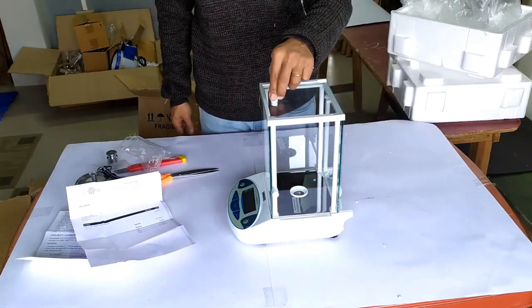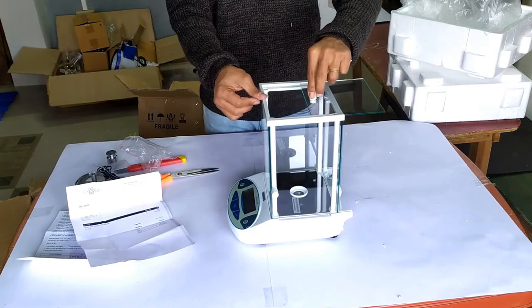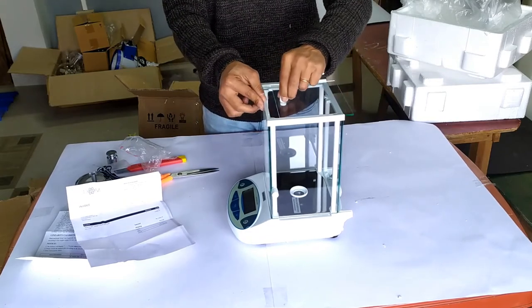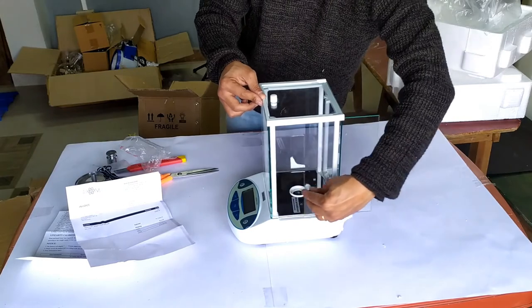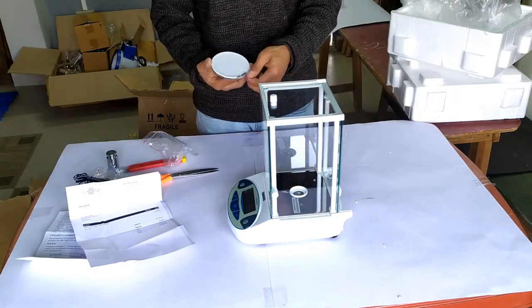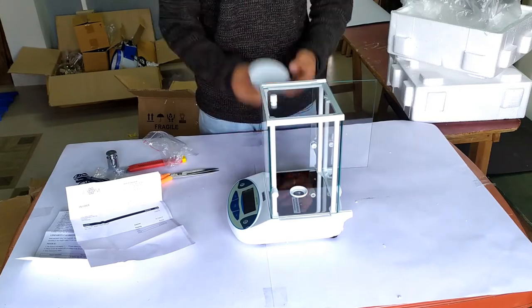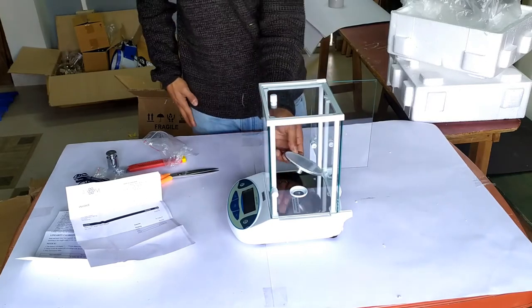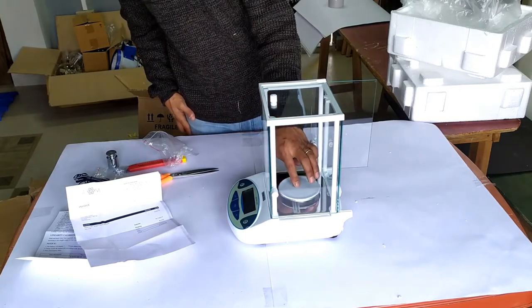The sliding glass doors are a bit rough to open and close though. We place the weighing pan in position.